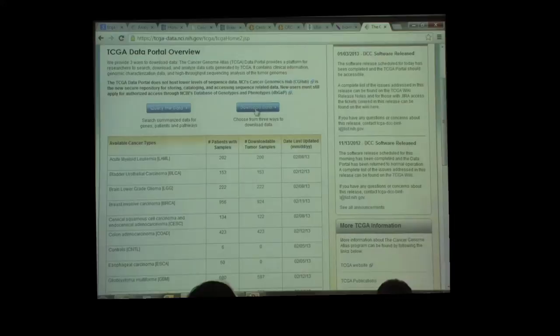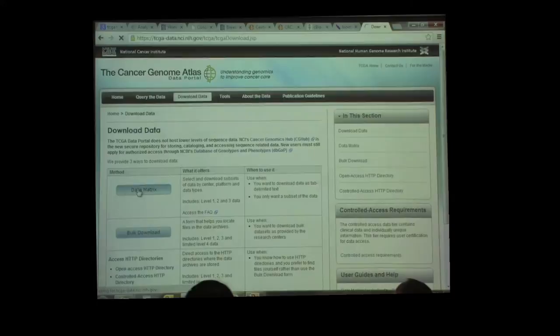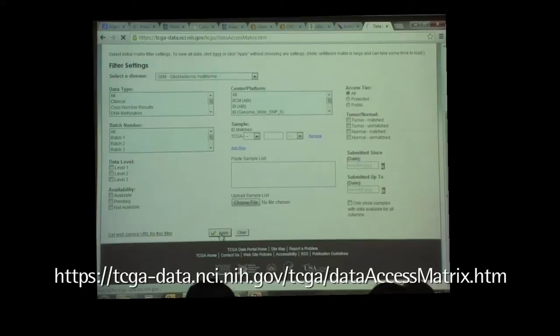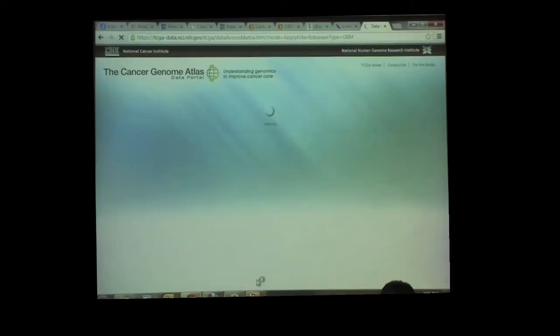If you actually look at a data matrix — I'll just show you a quick example. You go to data matrix, and just GBM. I'm going to hit Apply for just GBM. It's taking its time to load, and there's a reason for that — the data is huge.